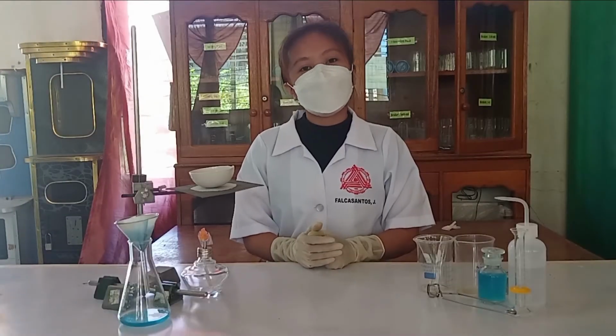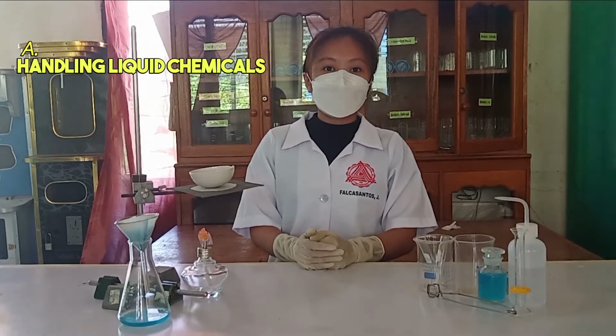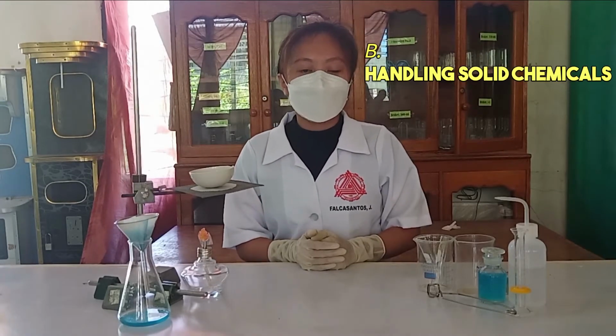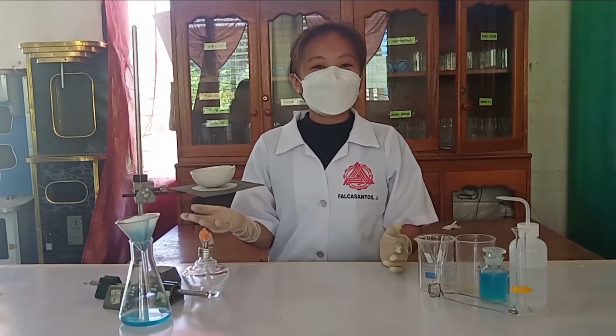Today, I will be showing you two parts of common laboratory techniques. Part A would be handling liquid chemicals, and Part B, handling solid chemicals. Now that we are all set, we can now start our activity. Let's go!